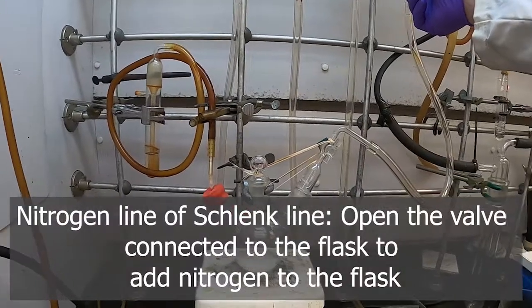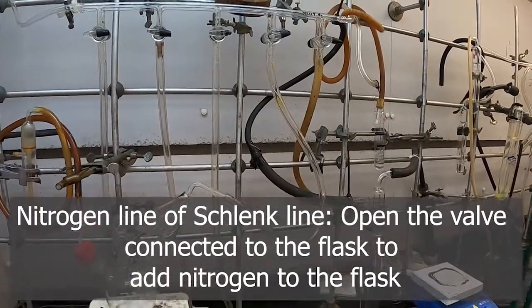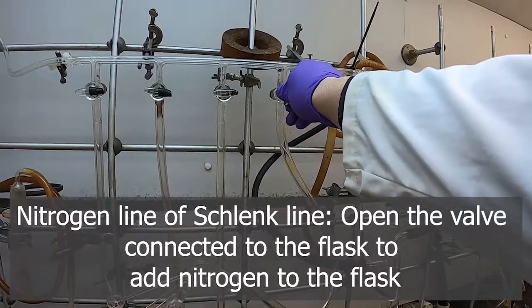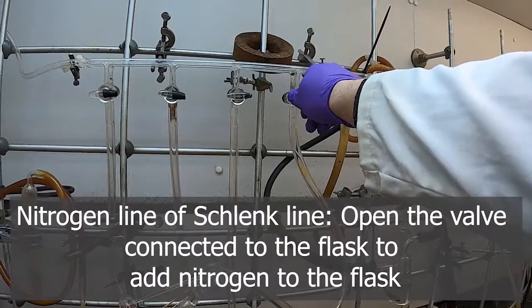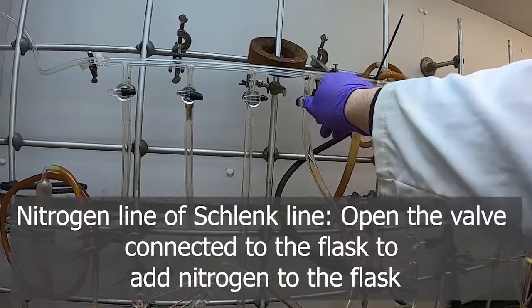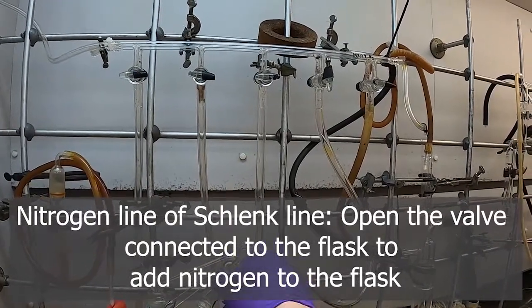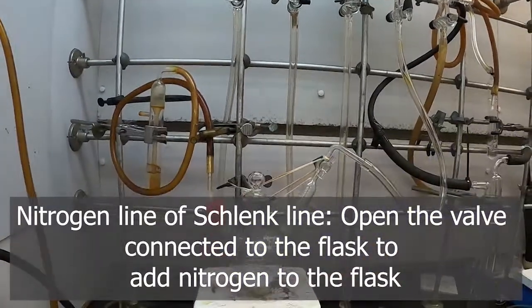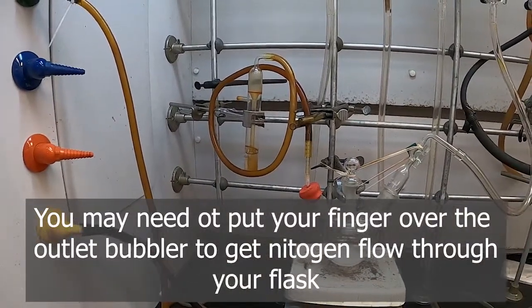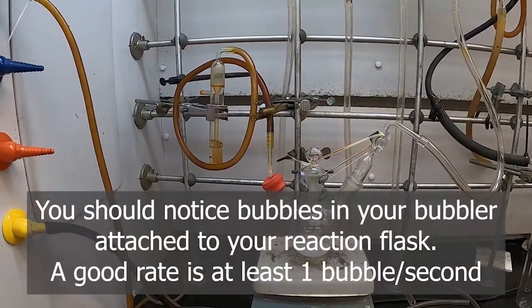And then we'll put this valve up here so we can make that visible. This valve here will turn upwards. So you may have to adjust your nitrogen flow to get it to bubble through your bubbler and through your system and through your bubbler.